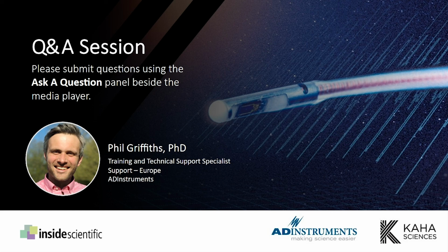My colleague, or ex-colleague, Sarah Jane presented a webinar on the surgical approaches and recording left ventricular pressure, which is available on the ADI website. And there are surgical videos on the ADI website as well, showing the surgical approach for implanting for LVP.